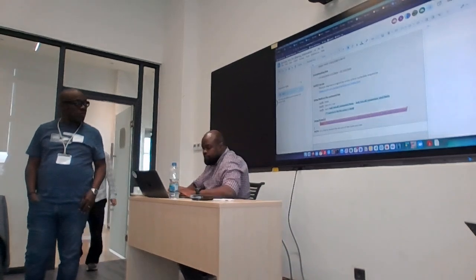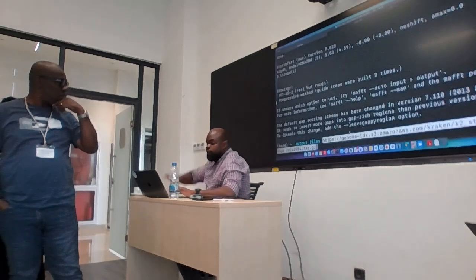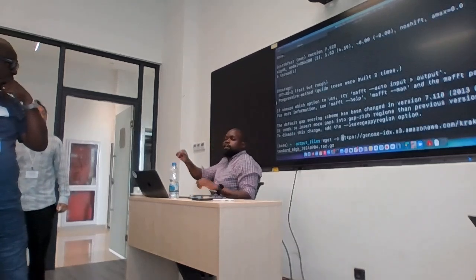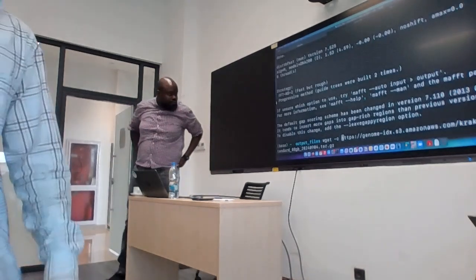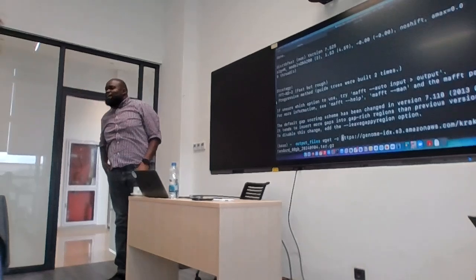Just run it and leave it on your terminal. And when you hit enter, then you just hit enter and then leave. Then we go for lunch. We'll come back, find it finished. Just saying 10 hours.